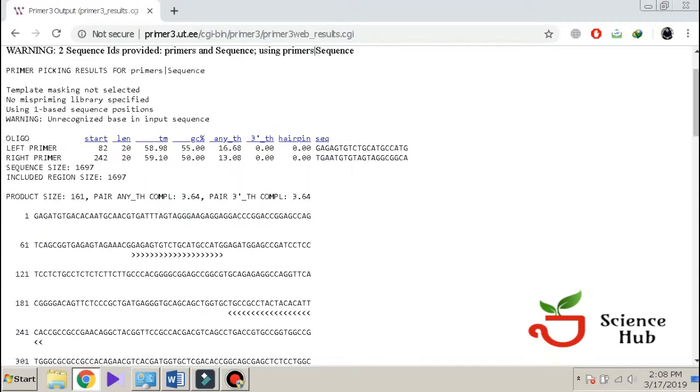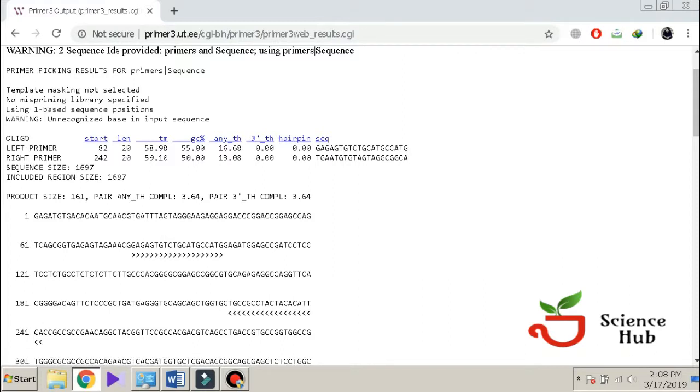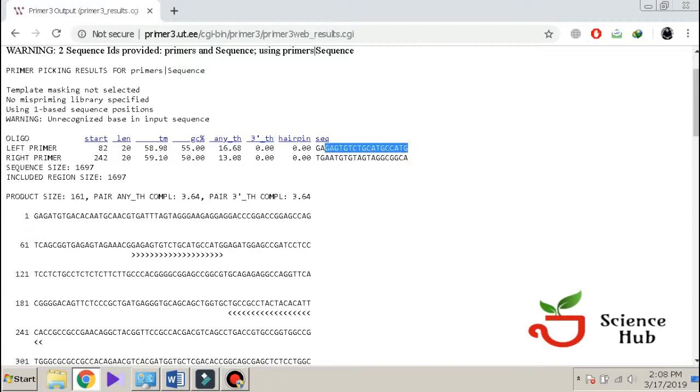It has given us the sequence. The left primer starts at 82 nucleotides and its length is 20 nucleotides. Its melting temperature is 58 and its GC content is 55%. Here is the sequence of that primer. This is a forward primer.